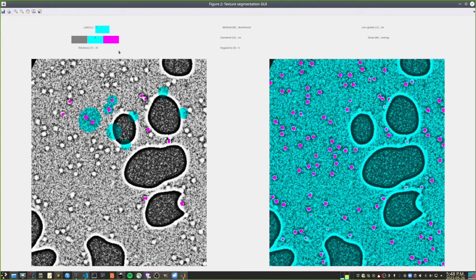Sometimes you're not even sure by eye too. That's one of the challenges of this kind of labeling, is that even yourself you're not sure.